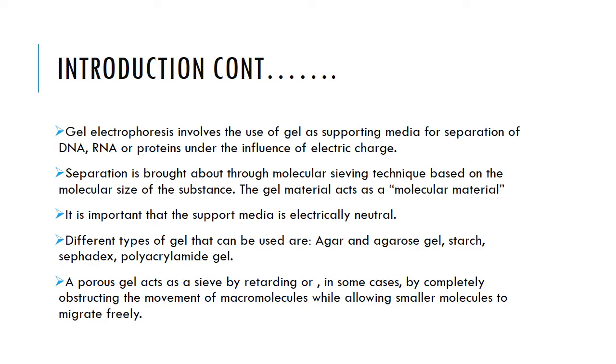Each and every time we are dealing with gel electrophoresis, we should always have in mind that there is an electric charge being applied at a certain point. The gel is a supporting medium for separation of, for example, DNA, RNA or proteins, and they are influenced by electric charge.